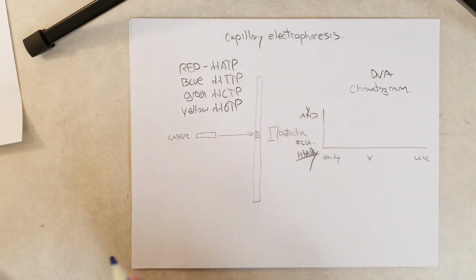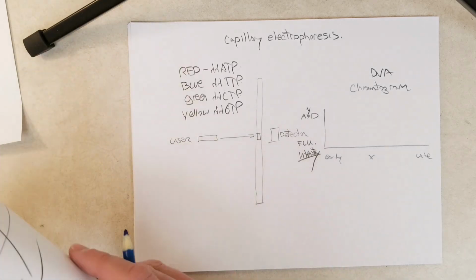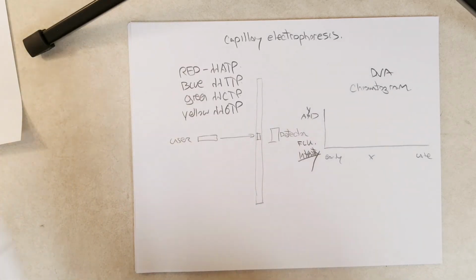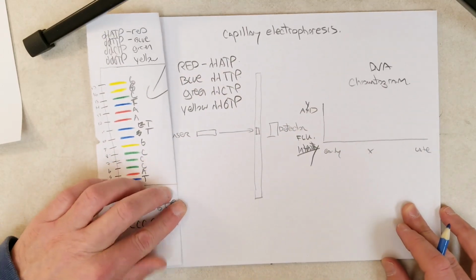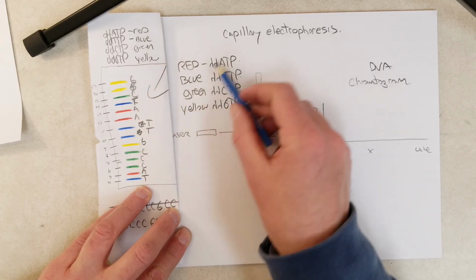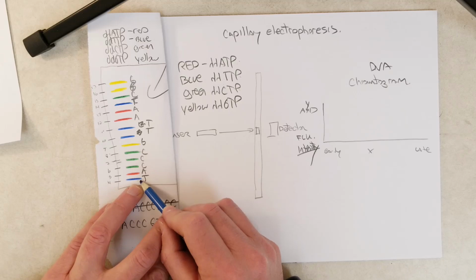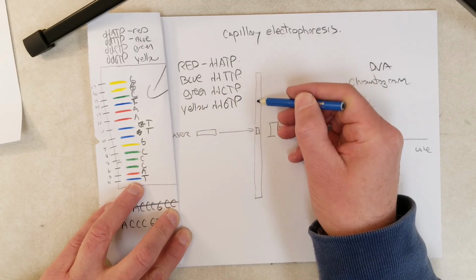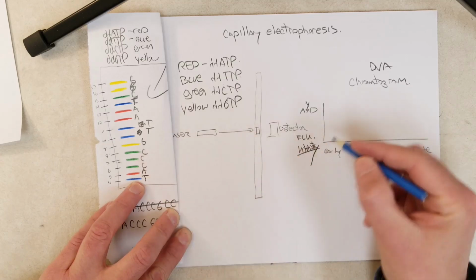would be the easiest way to set this up here. Keep everything. So in our previous example, right? If we did gel electrophoresis, the gel would look something like this. If we were using capillary electrophoresis, well, okay, this 4 nucleotide molecule would be coming through first because it's shorter than the others. And then we see blue.